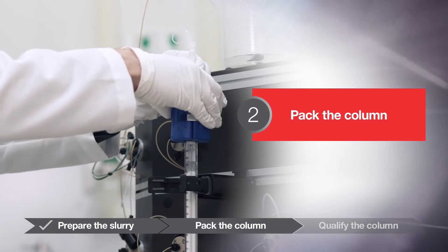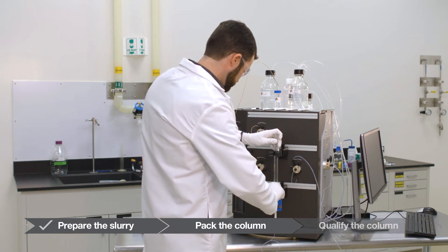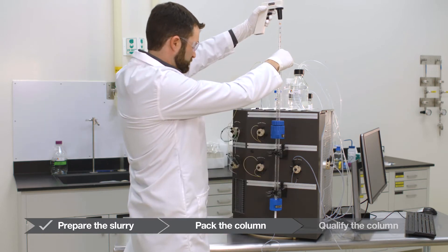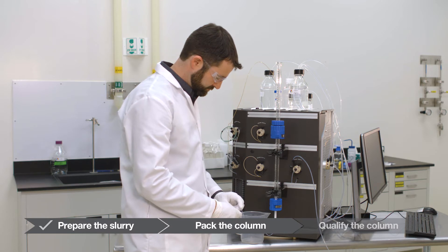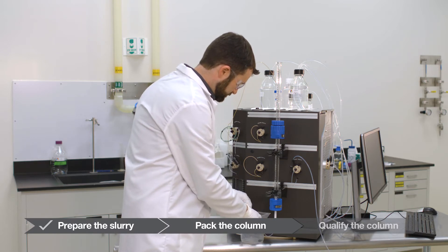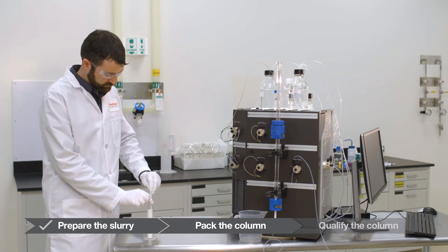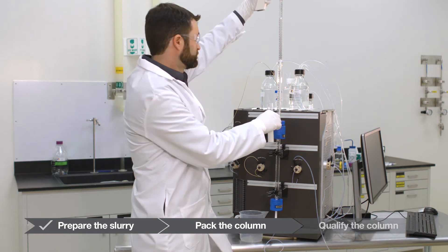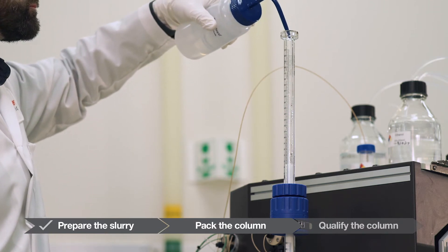Pack the column. Prepare the column by positioning it vertically on the chromatography system or on a column stand. If utilizing a column extender, attach it to the top of the column. Wet the bottom column distributor with 20% ethanol and ensure that the column outlet is closed. Do not connect the column outlet to the chromatography system, as plumbing into the system creates back pressure that fights against the inlet pressure. Ensure the column is secured in place, then pour the required slurry volume — in this example 27.7 milliliters — into the column. Use a squirt bottle to remove any residual resin from the column wall.